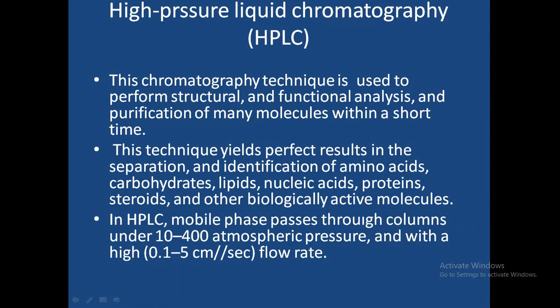And the last one, high pressure liquid chromatography. You can also call it high performance liquid chromatography, because the performance, the efficiency of the liquid chromatographic system to analyze, identify, separate and purify compounds is very high. That is why it is named high performance liquid chromatography.